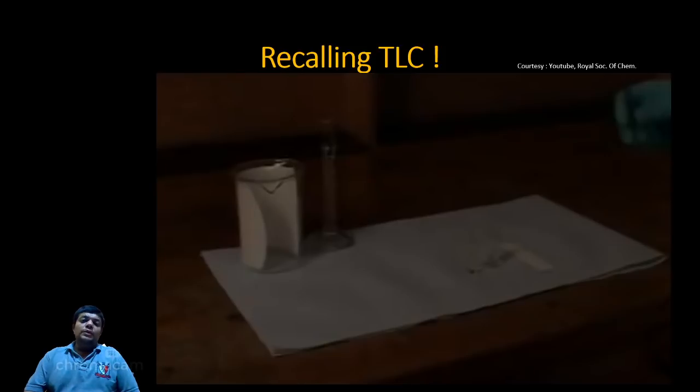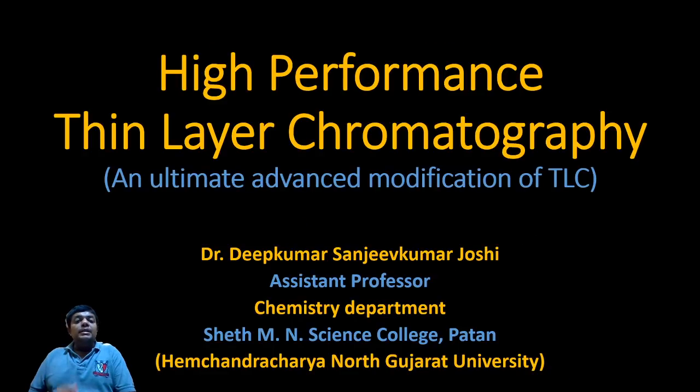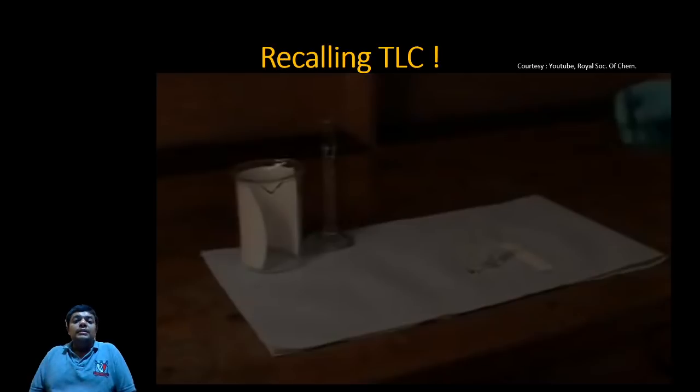Today, we are going to discuss more about HPTLC. But we also want to prove the statement, an ultimate advanced modification of TLC. And when you are modifying something, there should be some good thing that helped us to modify or to overcome the old. So before going into that, I'll just make you recall the whole procedure of TLC because it is very much needed and required over here. So we will just play this video and go through it. The video actions are important for this particular video and not the audio.